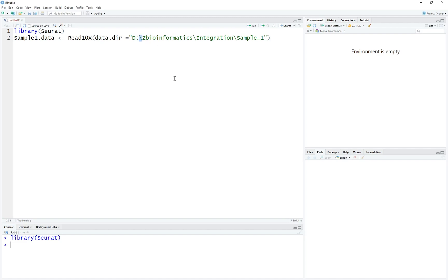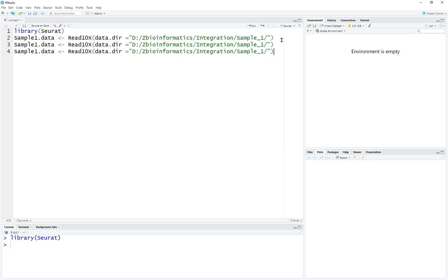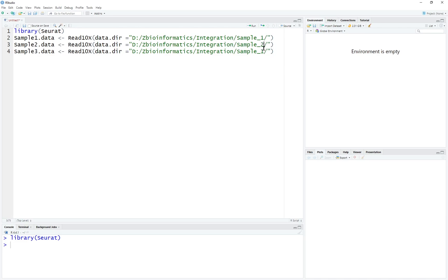But if you're using Windows, just remember to change the forward slash to backslash. Alright, this is sample 1. We're going to copy and paste it, load data 2 and data 3.